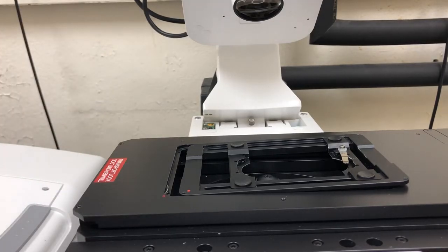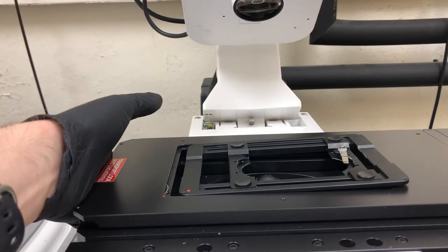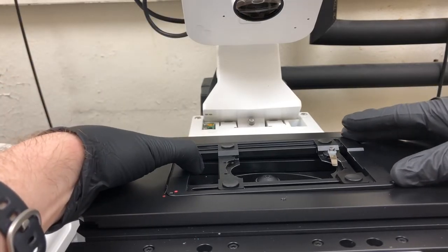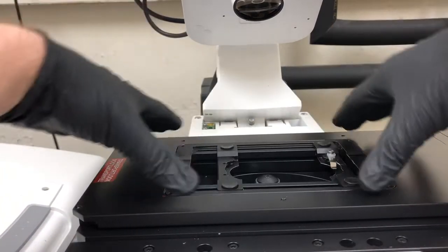What I do instead is put my left hand here and brace it, put my right hand here and guide it in, but most of the work is done by my left thumb to pull this into position. What I want is for it to be firmly in place.